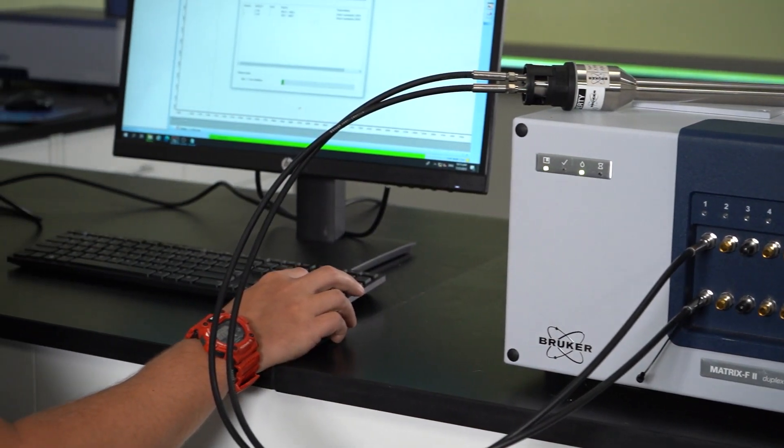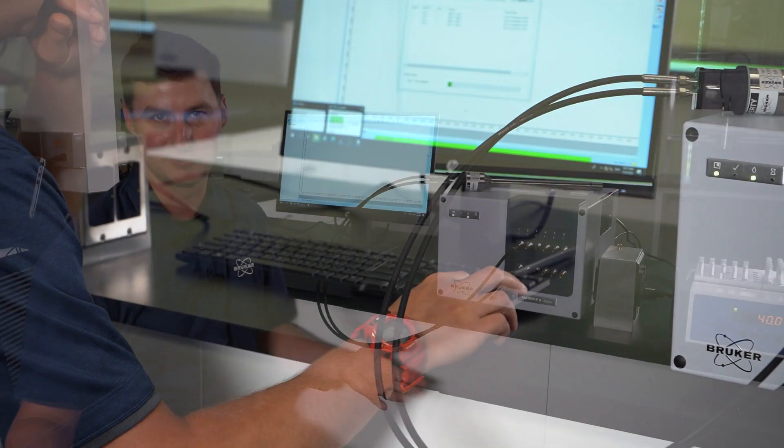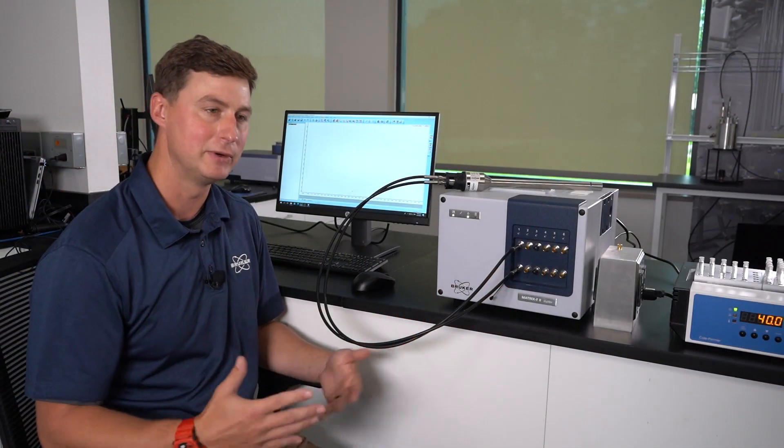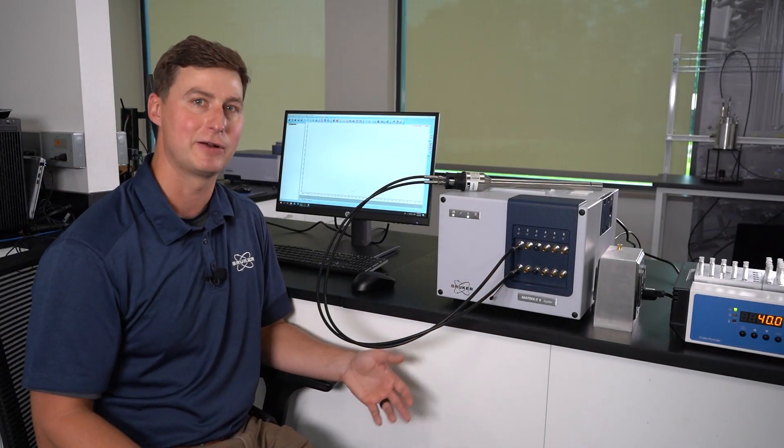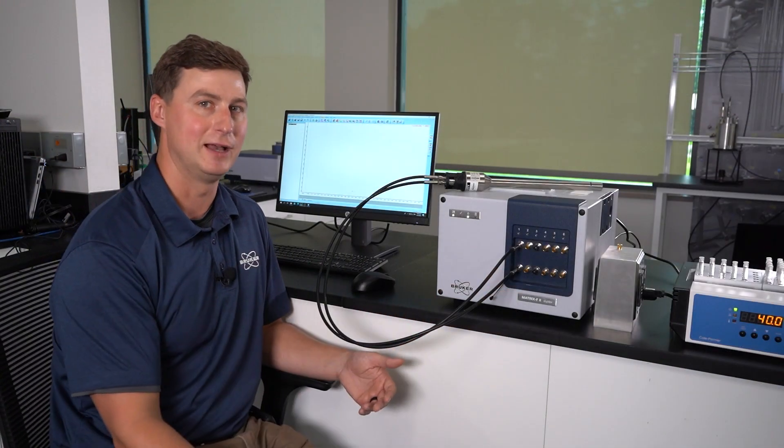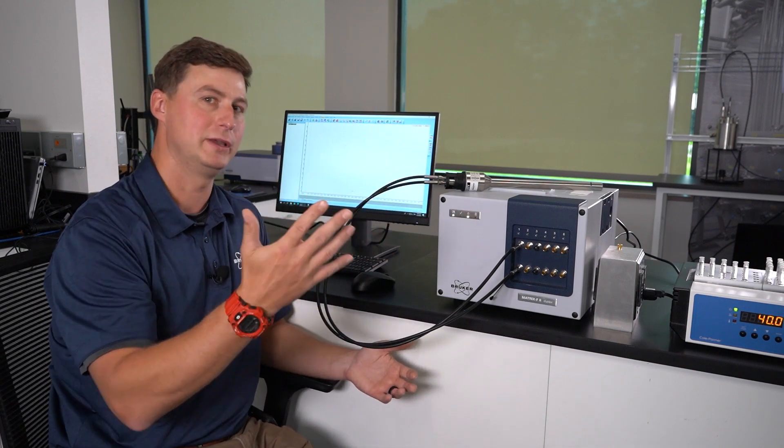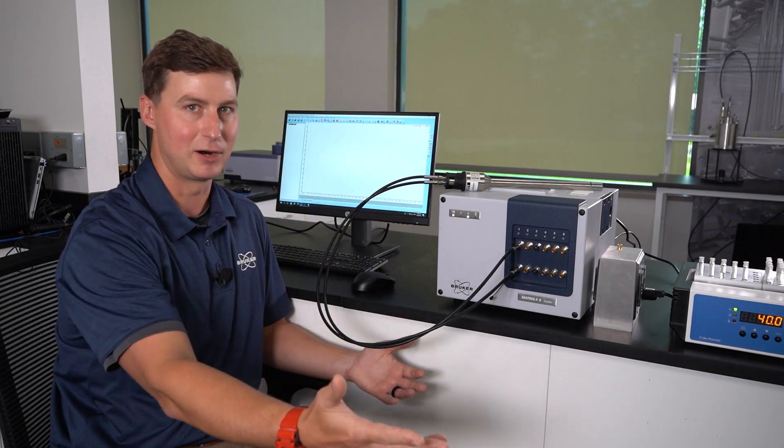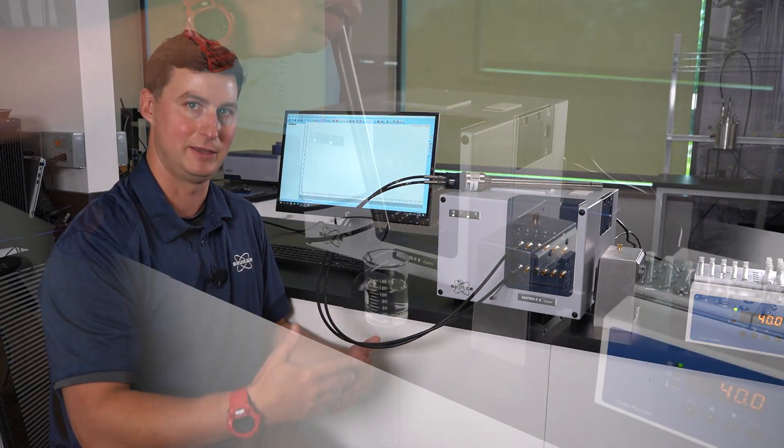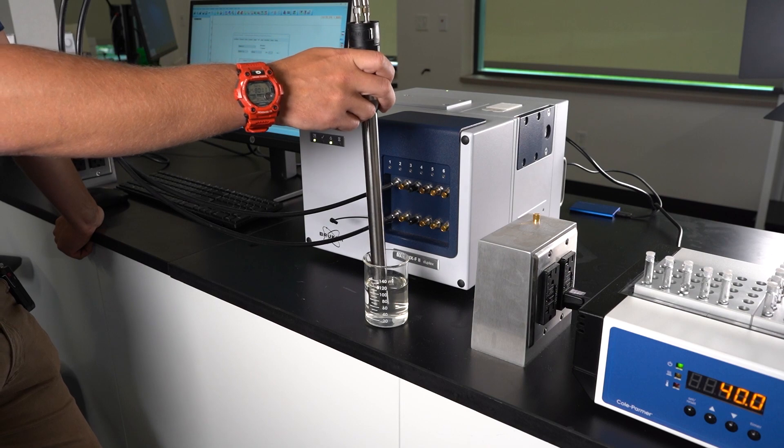Then the question becomes: what does the transfer look like? Really it's just a matter of collecting data from your inline system. So we take a probe, we put it in a process—in a pipe, in a reaction vessel.